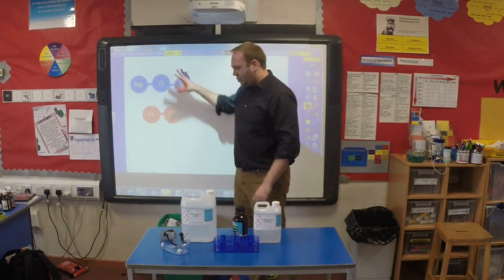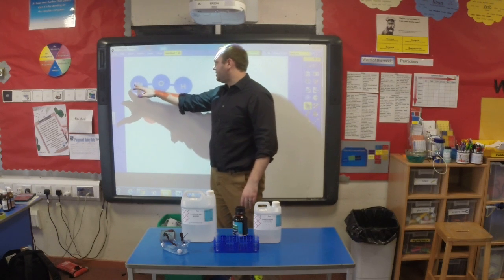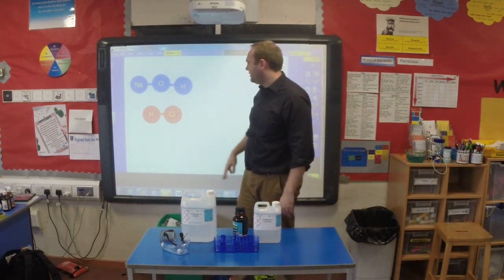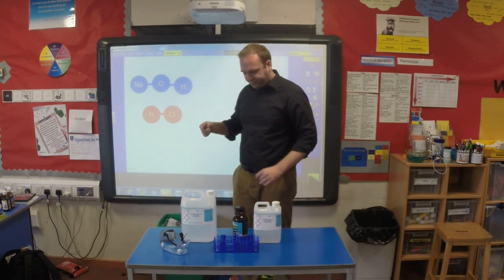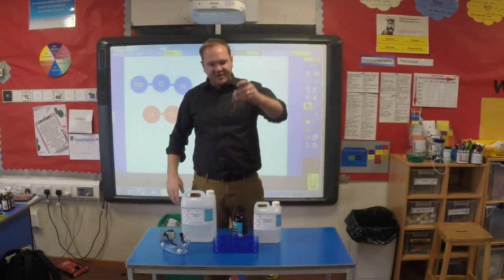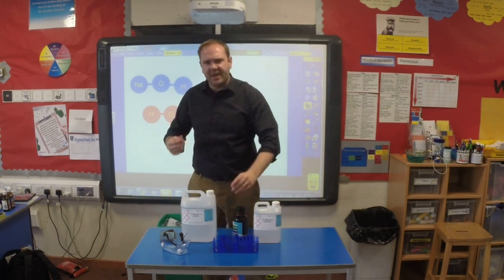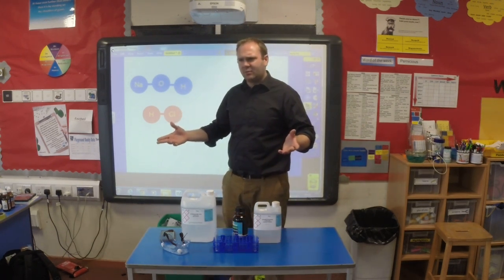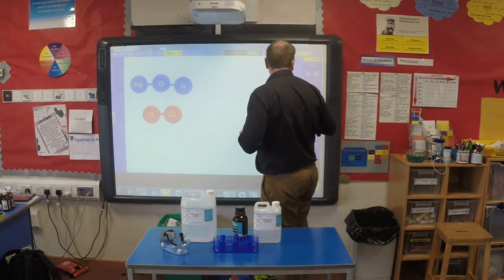So we have 2 chemicals here, 2 compounds. We've got sodium hydroxide, which is made of a sodium, an oxygen, and a hydrogen. And we've got hydrochloric acid, which is just a hydrogen and a chlorine. Well, what we've proved, every time we make it neutral, is that basically we're bringing it back to being water again. So we know that water is being produced, because water is neutral.